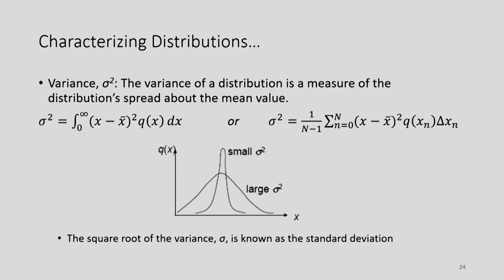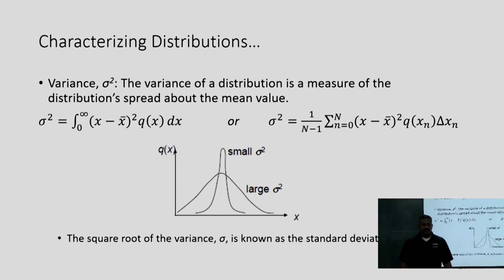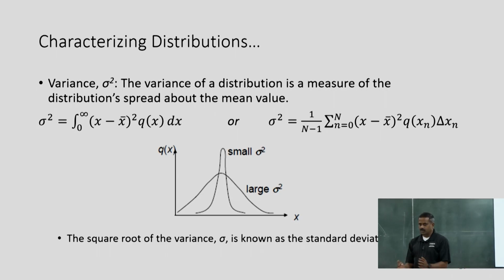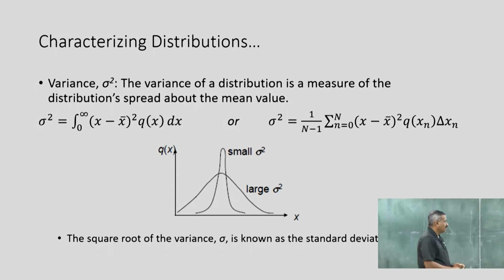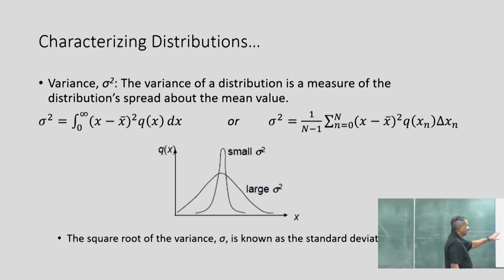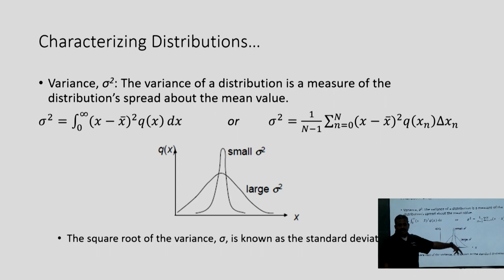Variance is very commonly used for quantifying these frequency distributions. A larger variance means the distribution will be spread wider. If it's a small variance, then the distribution is much tighter. I'm not going into the calculations. From the individual particle sizes and from their mean values, you calculate the variance.